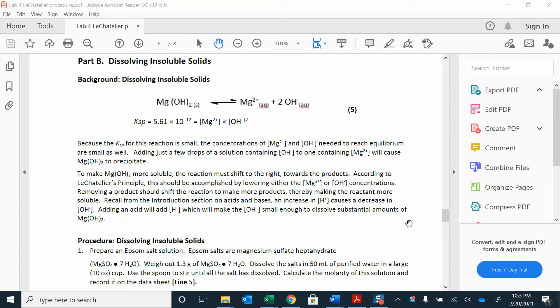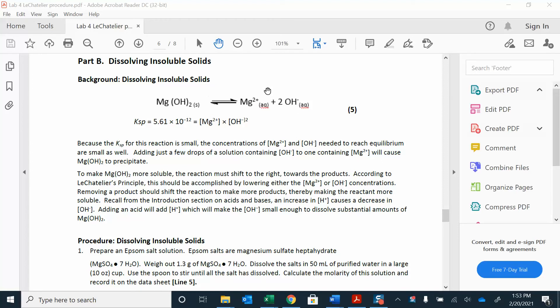We're going to take our magnesium sulfate — that's going to be our source of magnesium ions — and mix that with some sodium hydroxide, which is going to be the source of our hydroxide ions. We're going to be looking at this solubility equation: magnesium hydroxide dissociating into magnesium and hydroxide ions.